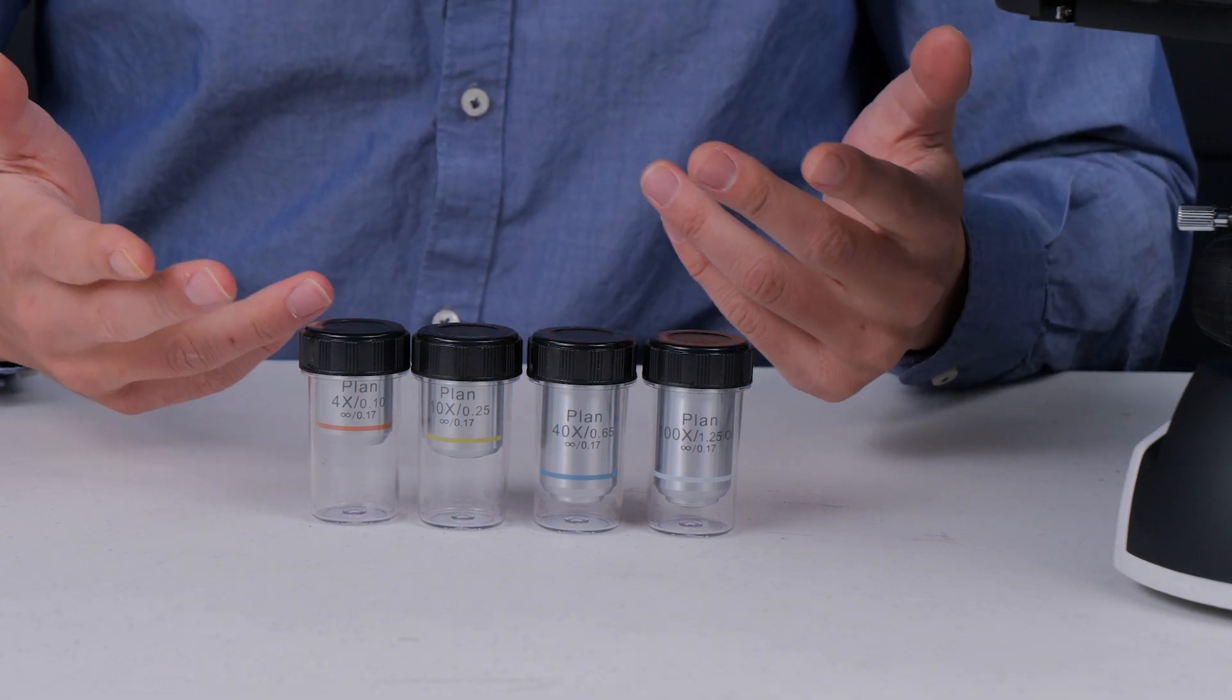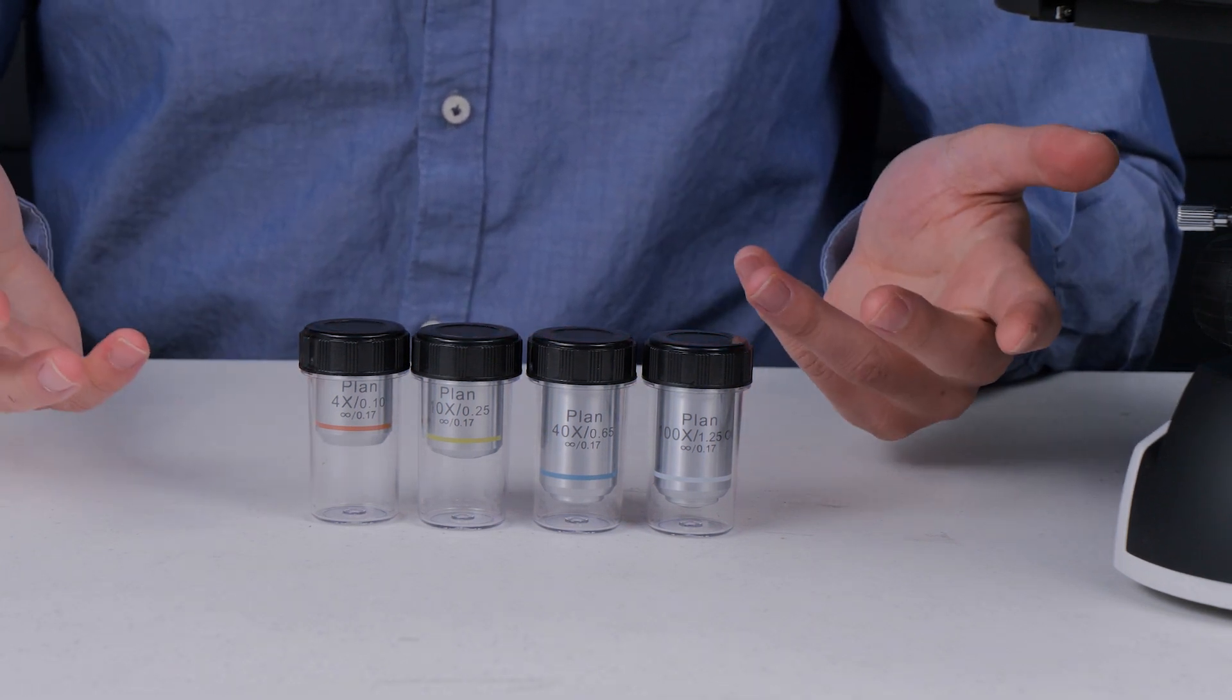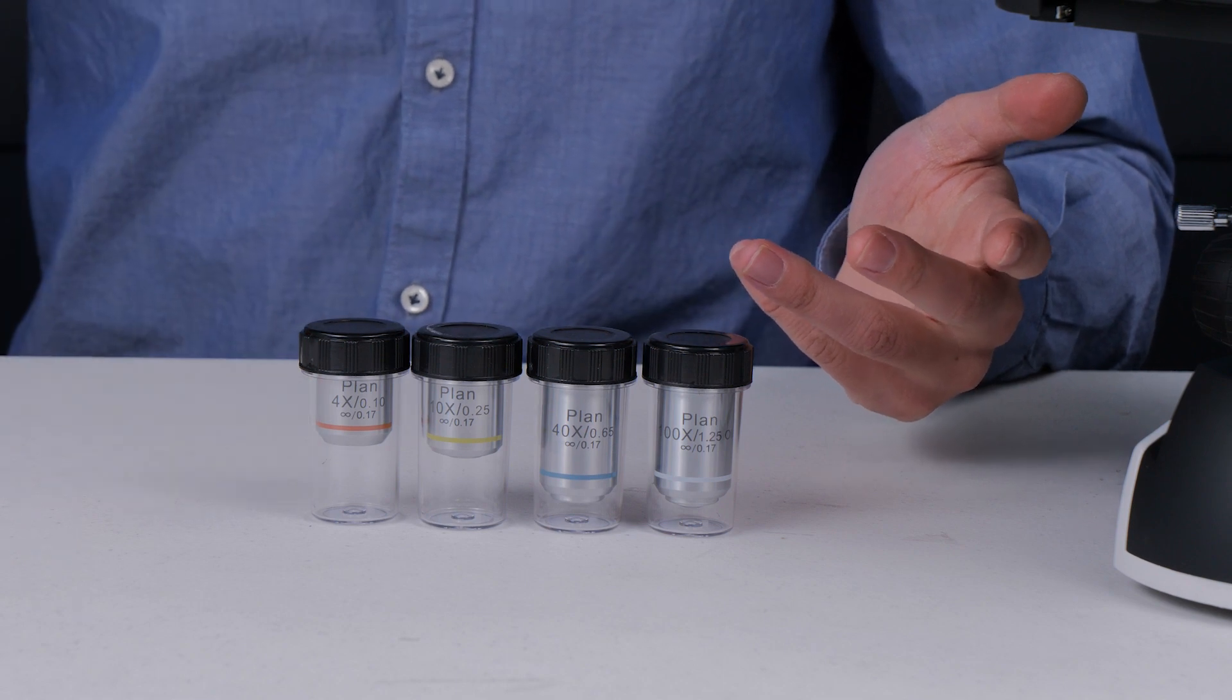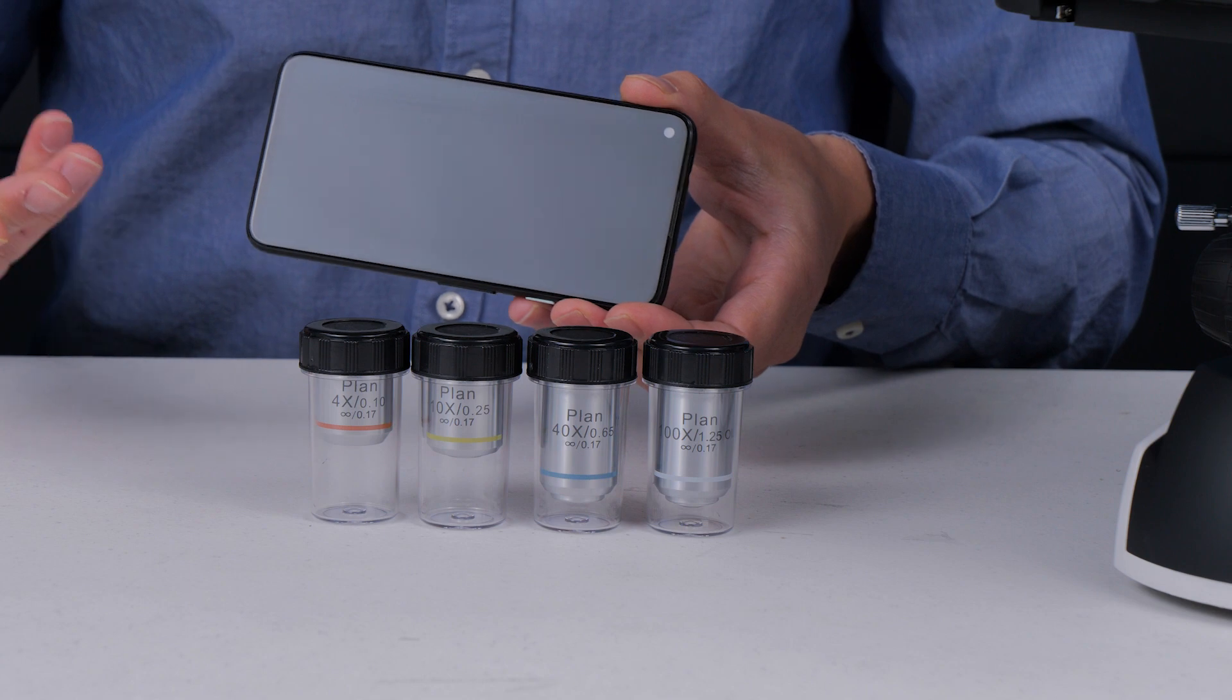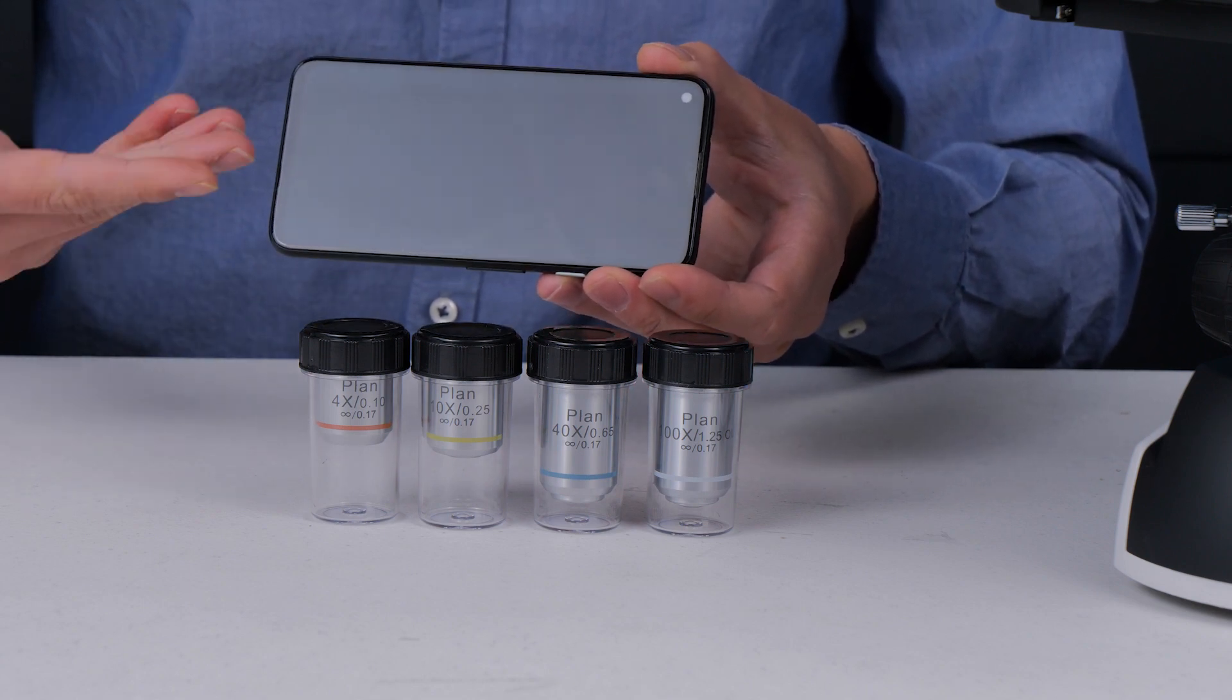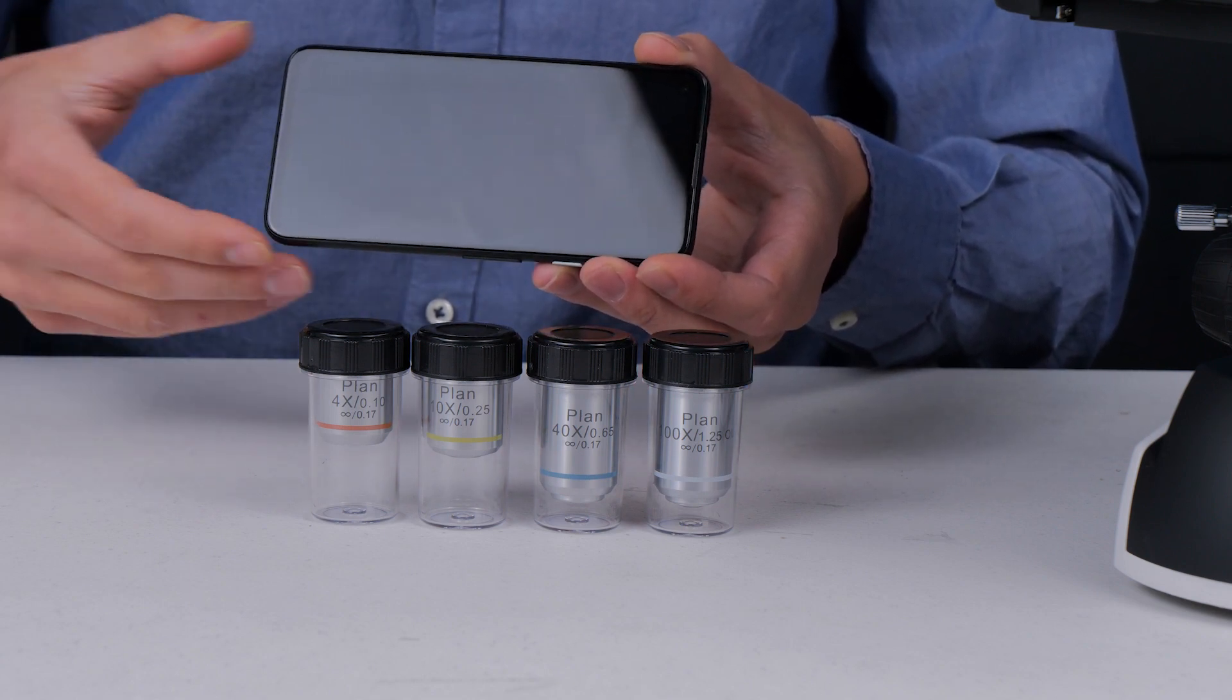So why wouldn't you just choose to always have a higher resolution? Why wouldn't you just choose to have a higher numerical aperture? Well in the same way that putting 4K on a phone screen is kind of silly because you're not going to be able to see any more detail on a 4K phone screen than you can on just a 1080p phone screen.